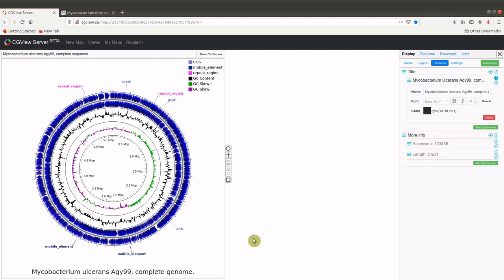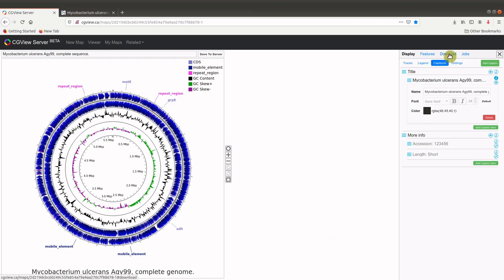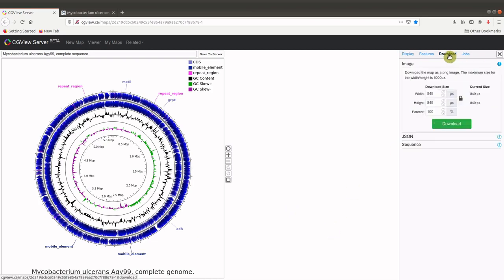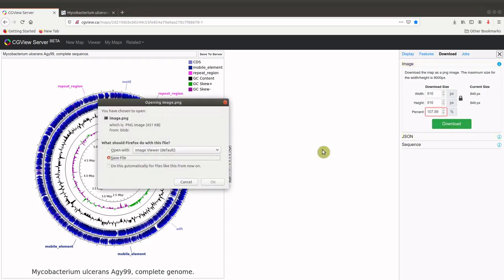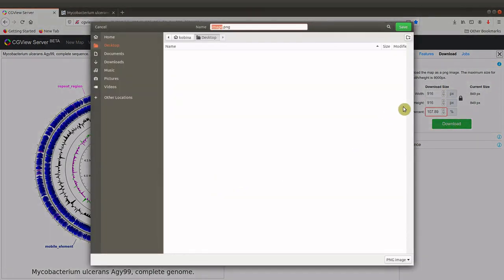And so because we are doing this on the web server, we want to download to our local machine. And we do that by using the download tab here. And then you can change the output size of the image, and then download it. So we download to our local machine.